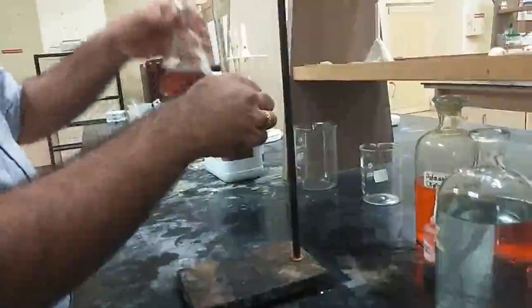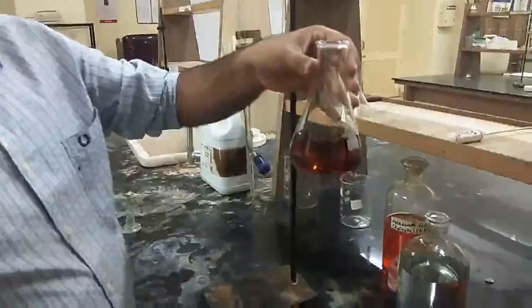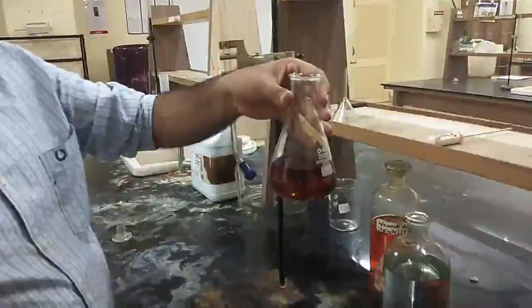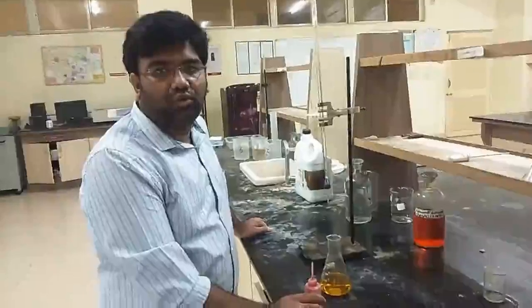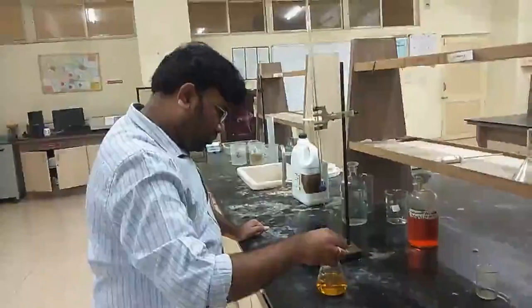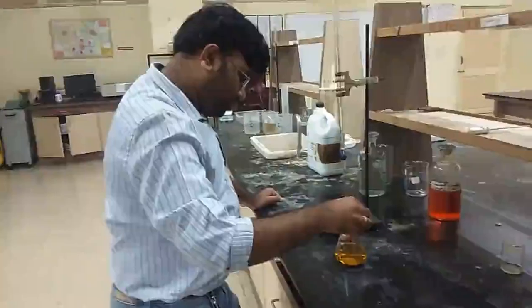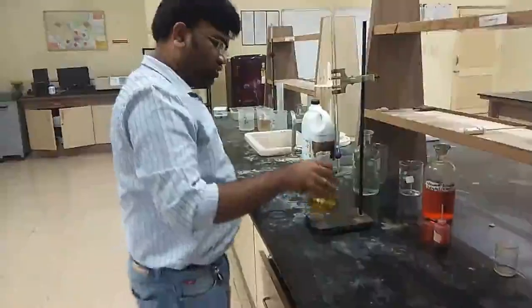So we have obtained this, the reading is coming out to be 24.9, right? So here you can see the color change has happened, and the A reading has come out to be 24.9, right? For blank, right? So the blank reading was 24.9. We are going to do the titration for sample. We are going to add ferroin indicator, and let's start with the titration process.